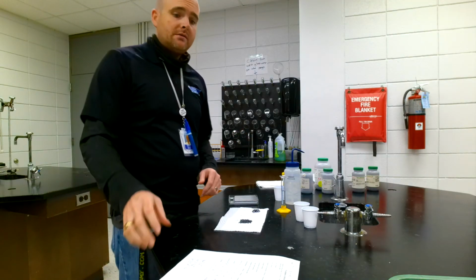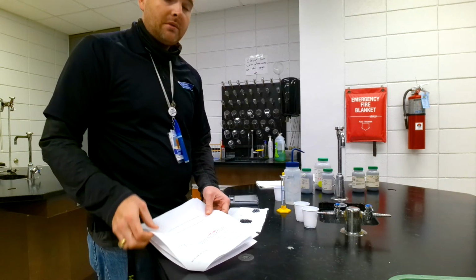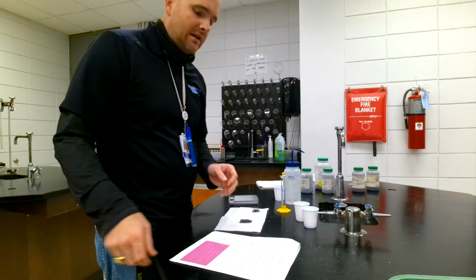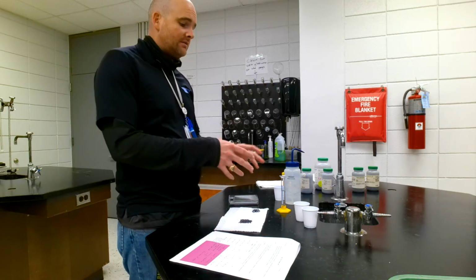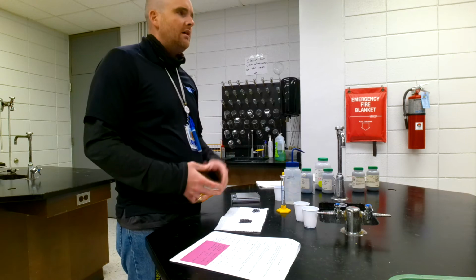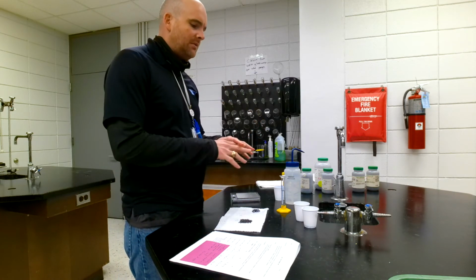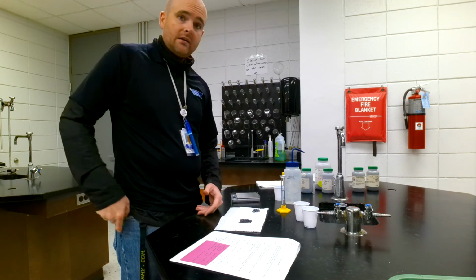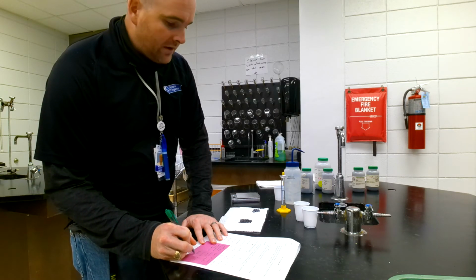Okay, magically I've changed clothes, and we are going to look at the error calculations, or the error listing possible sources of error. So a couple of things you should and should not say. We're really looking at methodological errors, that are errors that are actually in the experiment. We're not really looking at what I did or what the experimenter did or what was up to the individual person. We're looking at something that would be up to every single person who ran this experiment, whoever tried it.